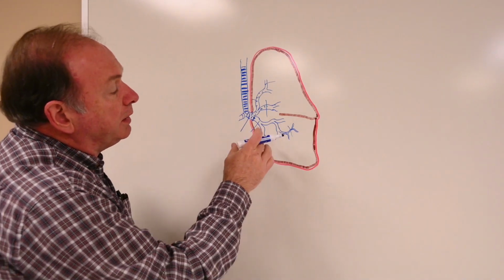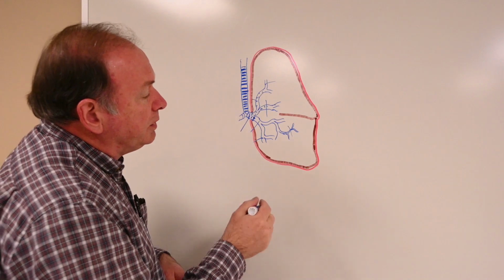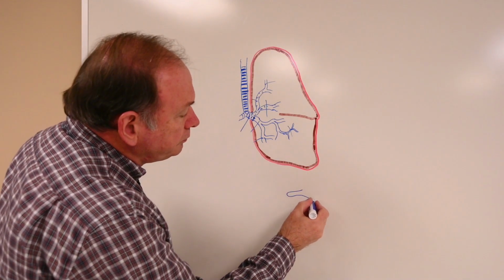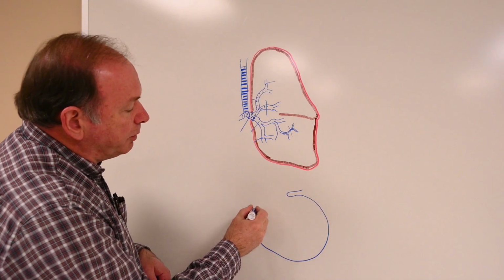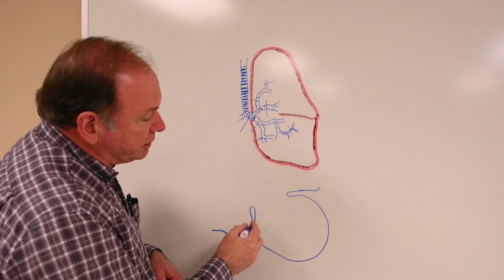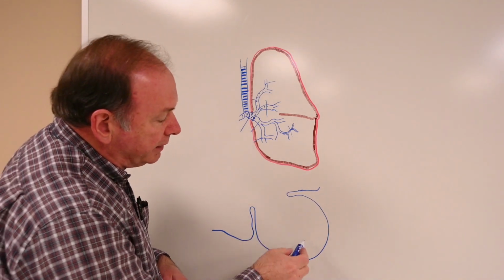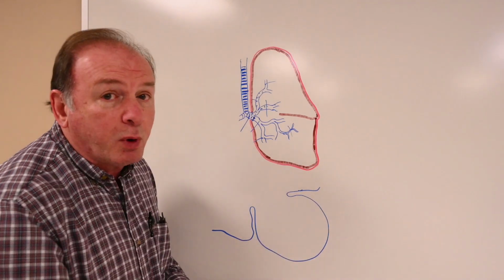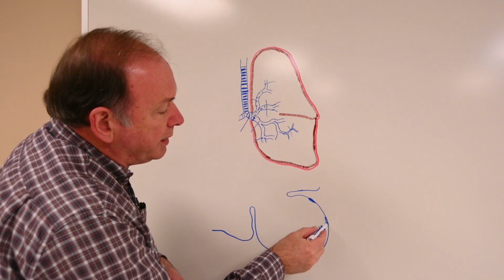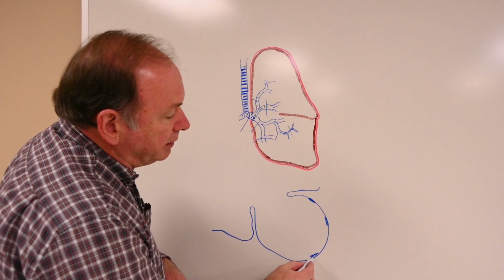We'll also be going in there and looking at the alveoli. When you look at an alveolus, say this is an alveolar pocket right here. It's adjacent to other alveolar pockets. On the wall of the alveolus, we'll want to look for the simple squamous nuclei, simple flat nuclei on the wall of the alveolus in there.